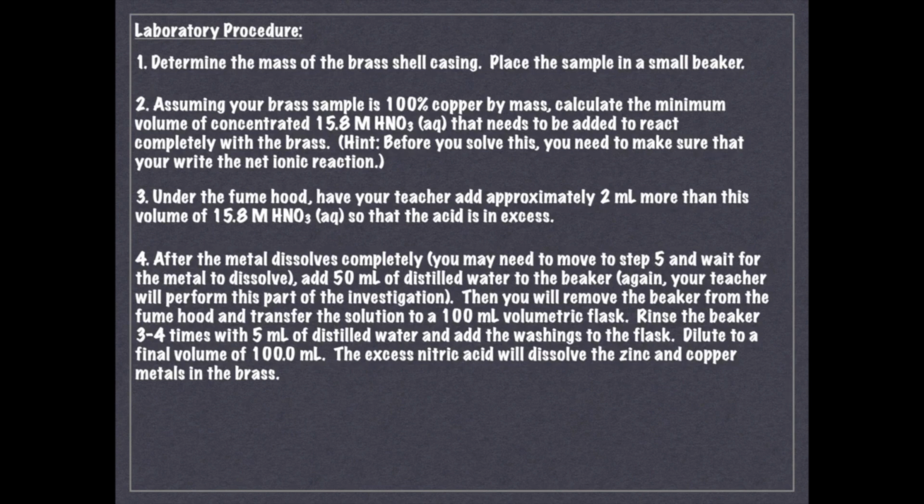All right. So this is what you're going to do after we've created the Beer's law curve, after you've given the nitric acid the opportunity to dissolve away your shell casing. Now, the reason why I didn't show this is that I want this to be a surprise. I want you guys to see what it looks like. So you just have to follow the instructions, and it's pretty simple.